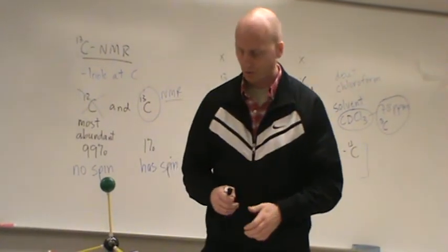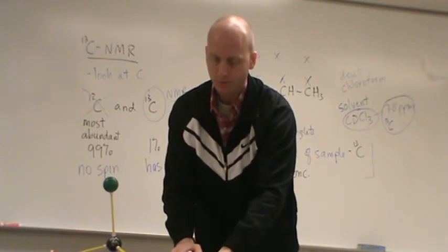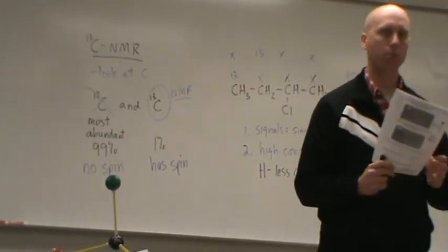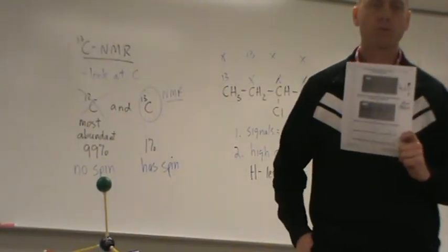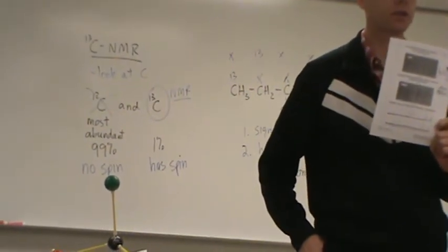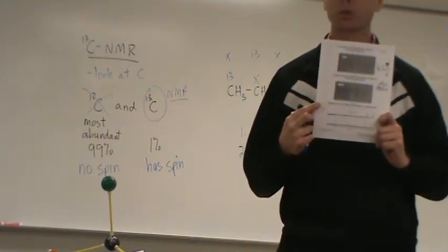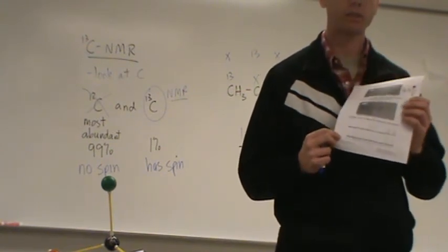So why don't you go ahead and take your handout, pull it out, and look at the front page at the bottom. You'll see your first C13 NMR. If you look at the box, you'll see two spectra. Just look at the bottom one for now.